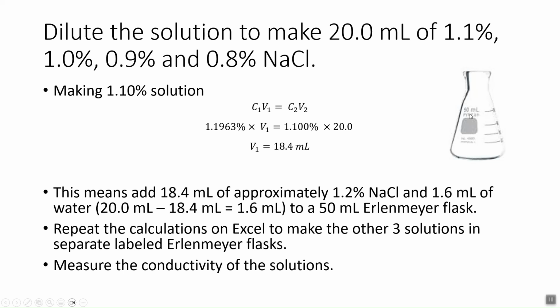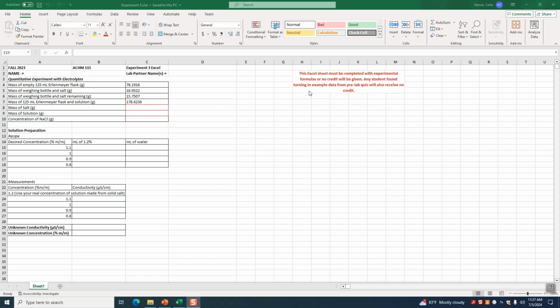So now that we've talked a little bit about how to do this math, I want to show you in Excel how we can do this math. Alright, so for this section I'm going to splice together a couple of videos, so you may see some of these things move a little bit further into this video, but that's not a big deal. We don't really want you copying the exact cell addresses anyway. We want you to understand how to do this so that you can do it independently.